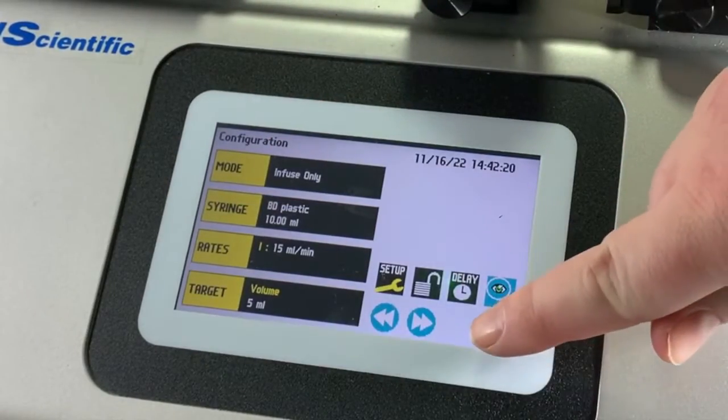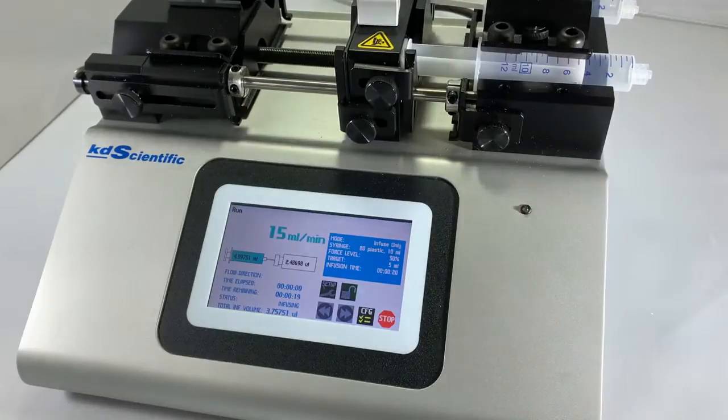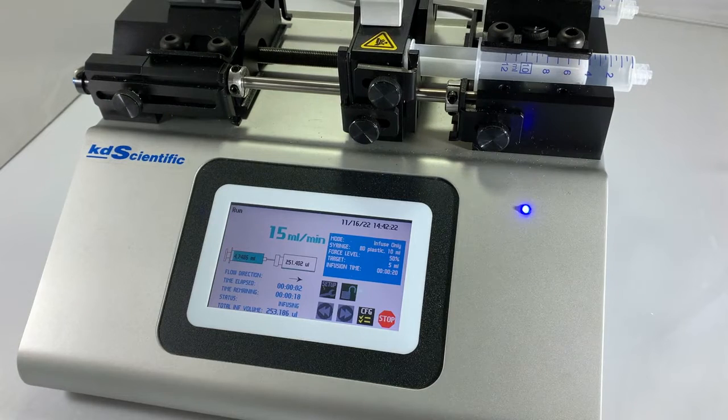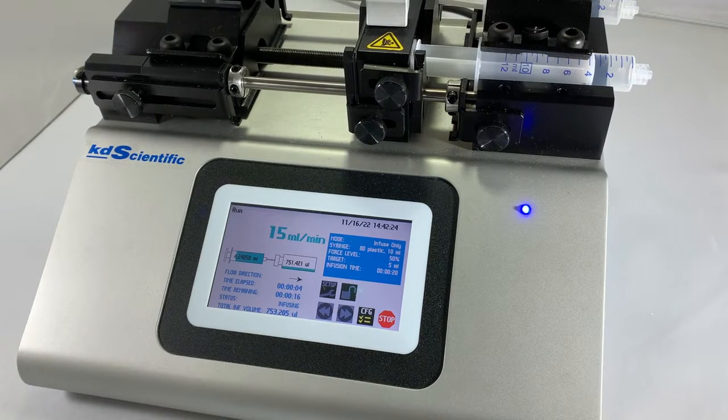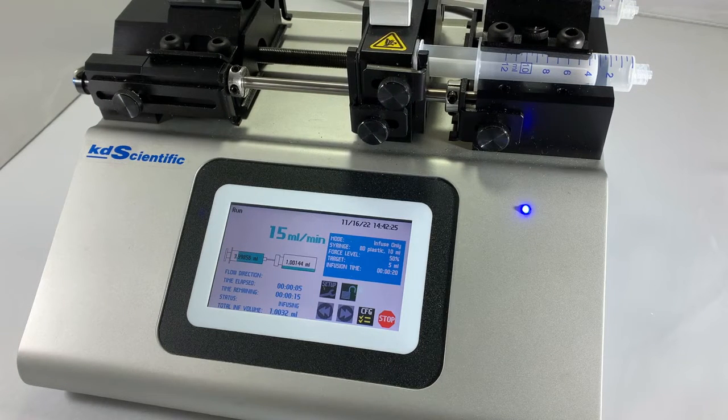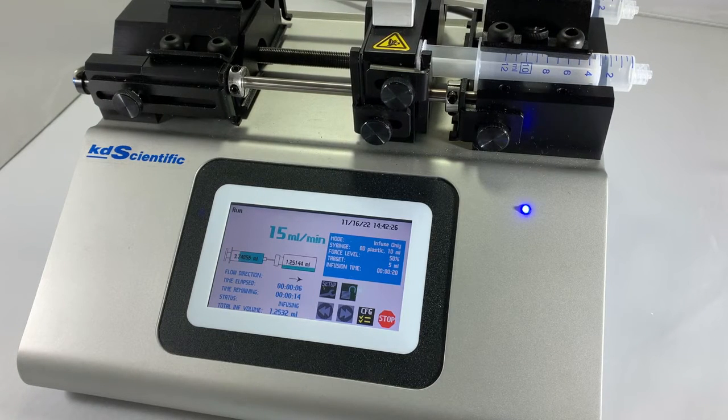Once you've set those things, all there is to do is press run and watch some of the most precise dispensing of liquids you'll see in your lab.